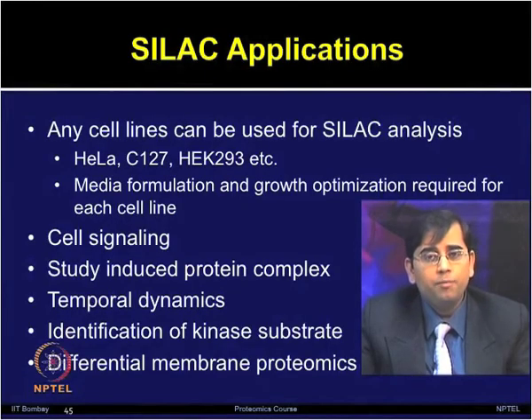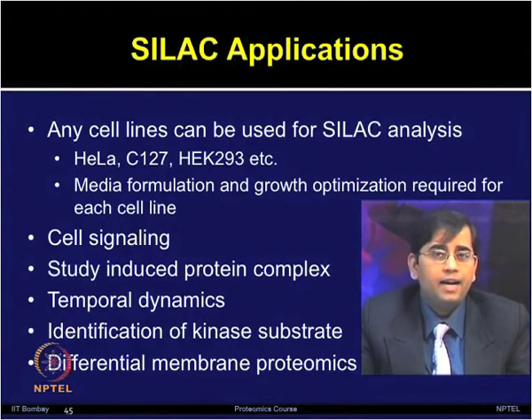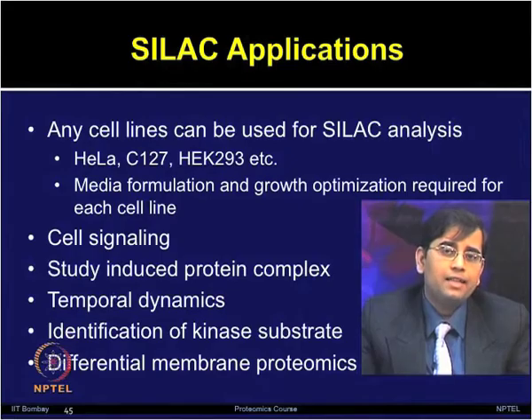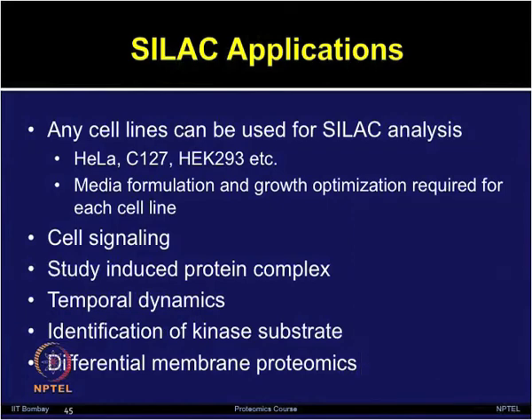SILAC has been demonstrated in different applications such as cell signaling, studying induced protein complexes, studying temporal dynamics, identification of kinase substrates, and studying differential membrane proteomics. So, there are various applications. We will have a look at some applications now.